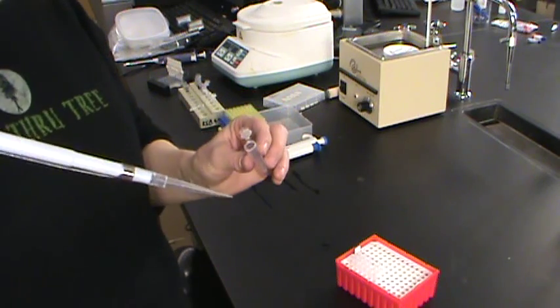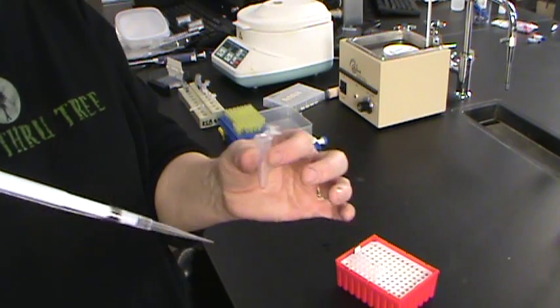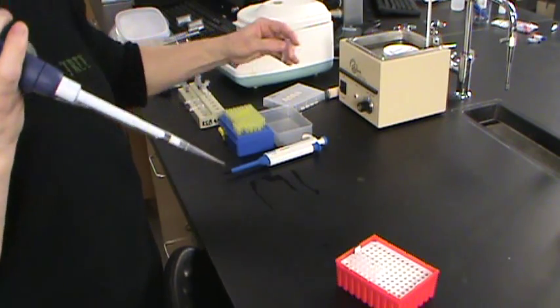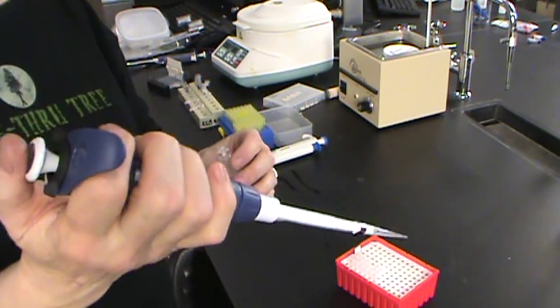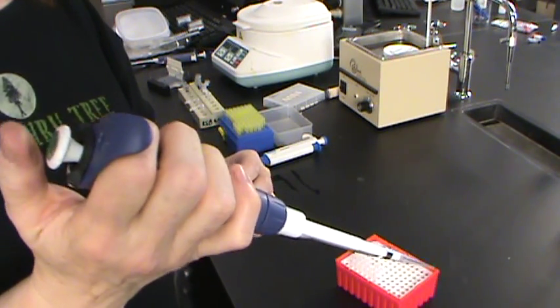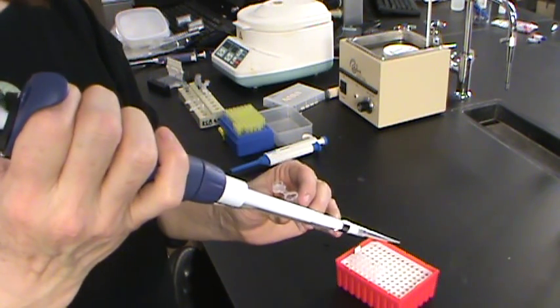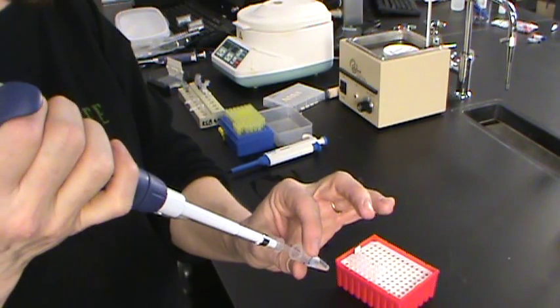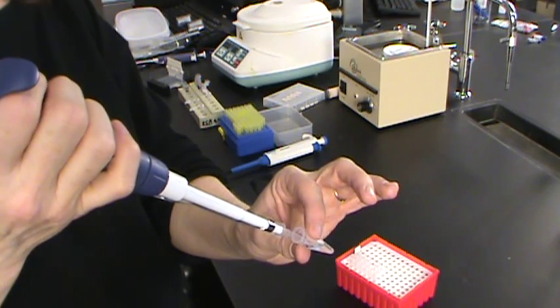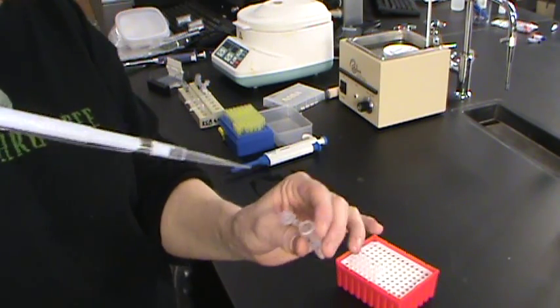Now, anytime we do micropipetting, this seems like it'd be easy to do, but to do this accurately, we need to follow some guidelines. If you play with the plunger, you'll note there's a first stop and a second stop. When you take up volume, go to the first stop in the pipetter, put the tip just beneath the surface of the liquid that you're pipetting, and let the plunger up slowly.